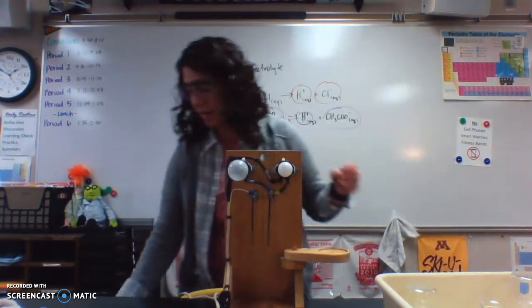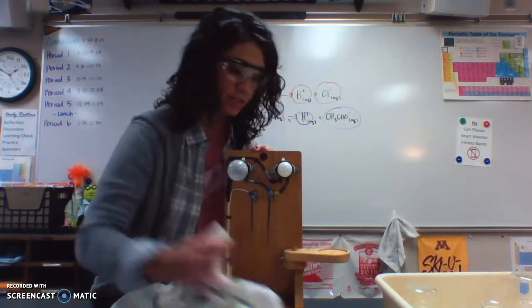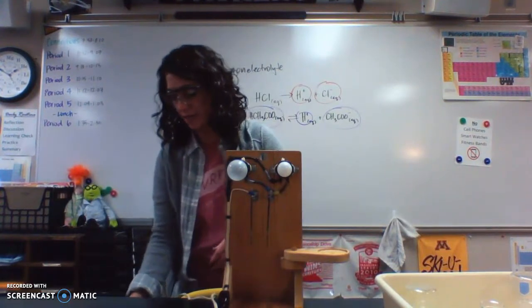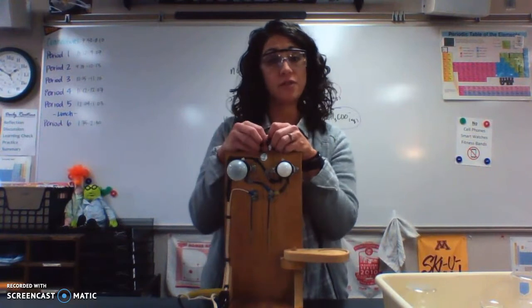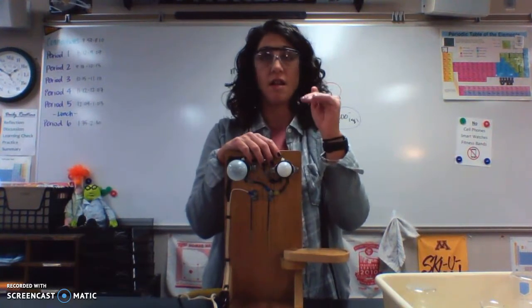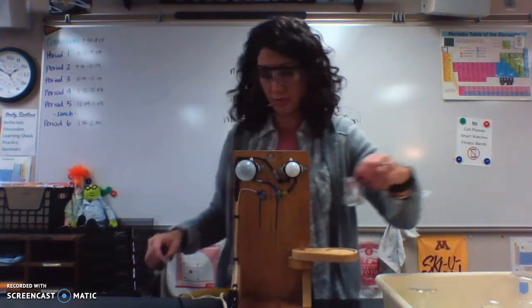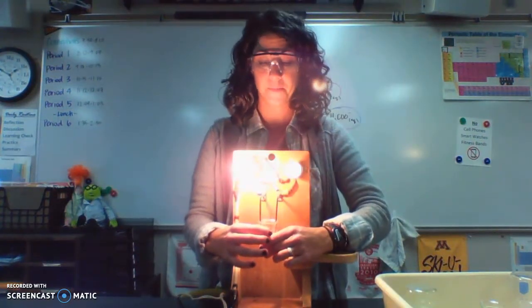Okay. My next two are both HCl, both hydrochloric acid, but there's a difference. That M there stands for what we call molarity, and that's something we're going to get to later in this unit. So the higher that value, the more concentrated it is, meaning the more of whatever your substance is. So in this case, 6 molar HCl has more HCl than the 1 molar HCl. So let's put 1 in first. Woo! We got a strong electrolyte.